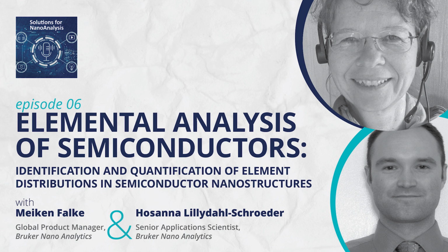Fair enough. So going back to your discussion of trying to use dark field contrast images to determine differences between elements, basically using those instead of, say, EDS or EELS or some other elemental analytical technique. Arthur, on that note, if you're dealing with, say, multiple heavy or multiple light elements, moving towards the light elements, like, say, nitrides used in semiconductors, also carbon, boron doping.